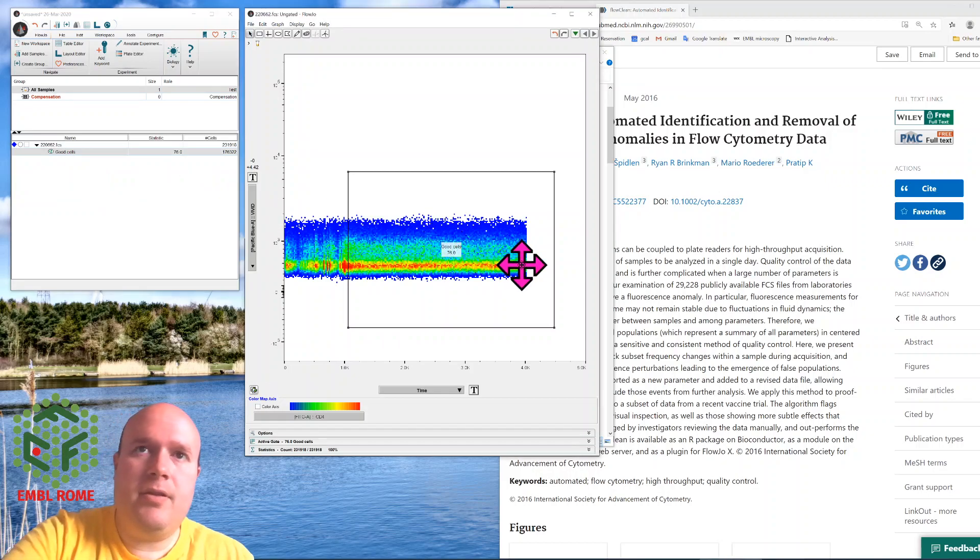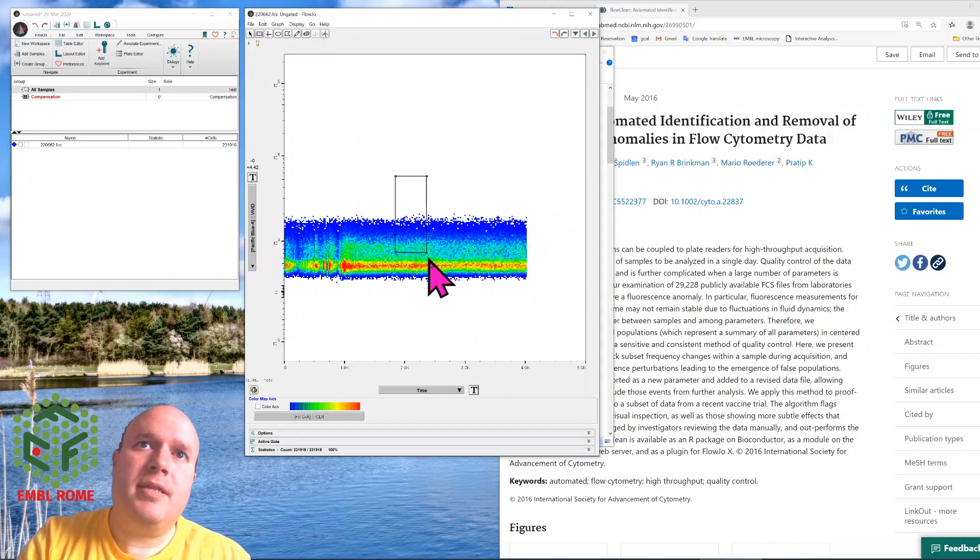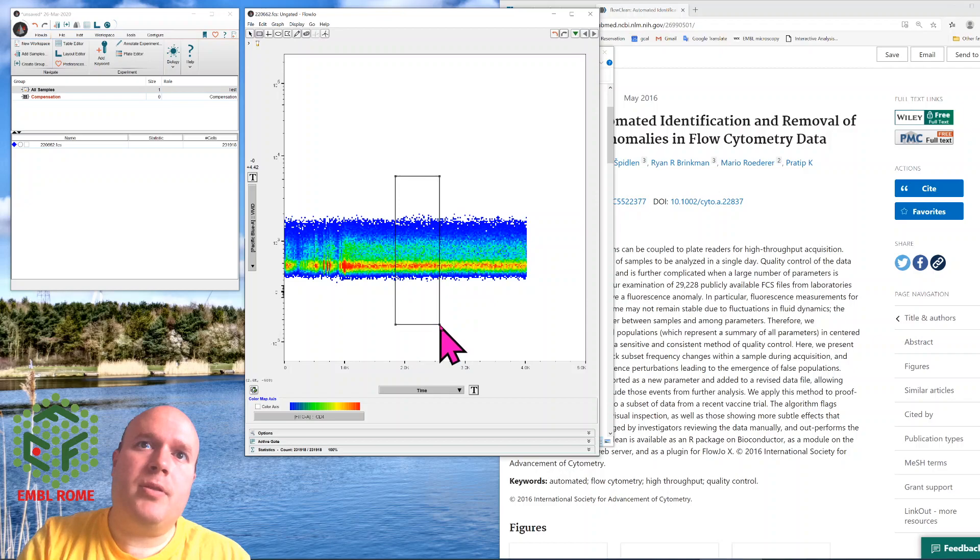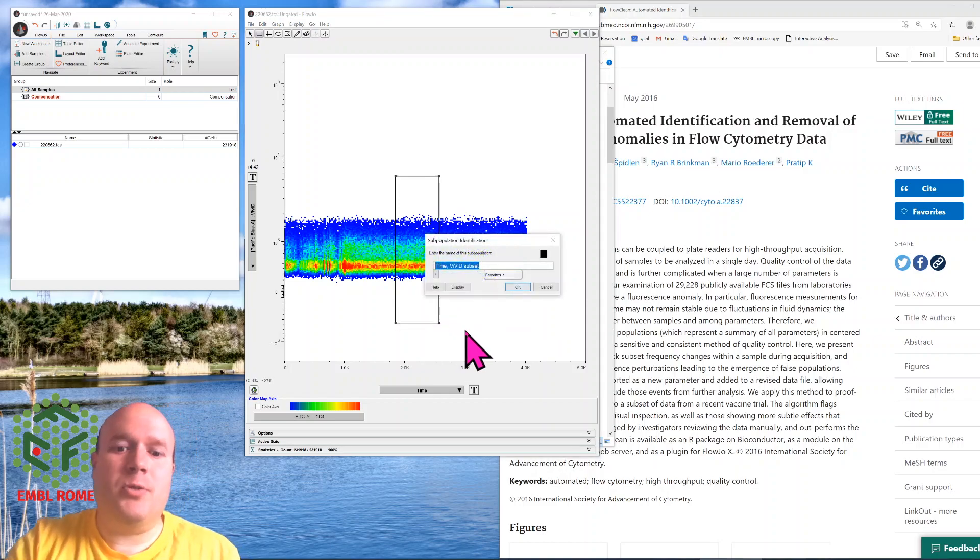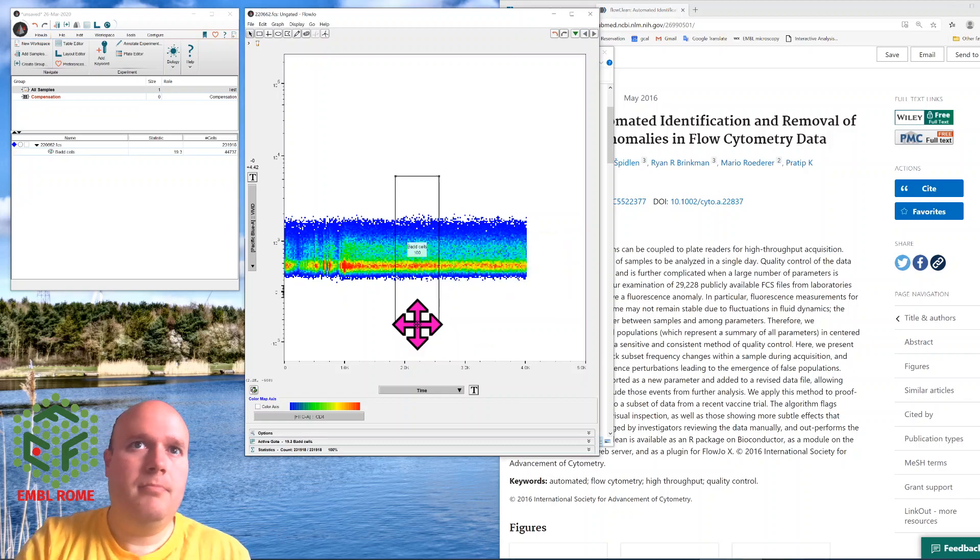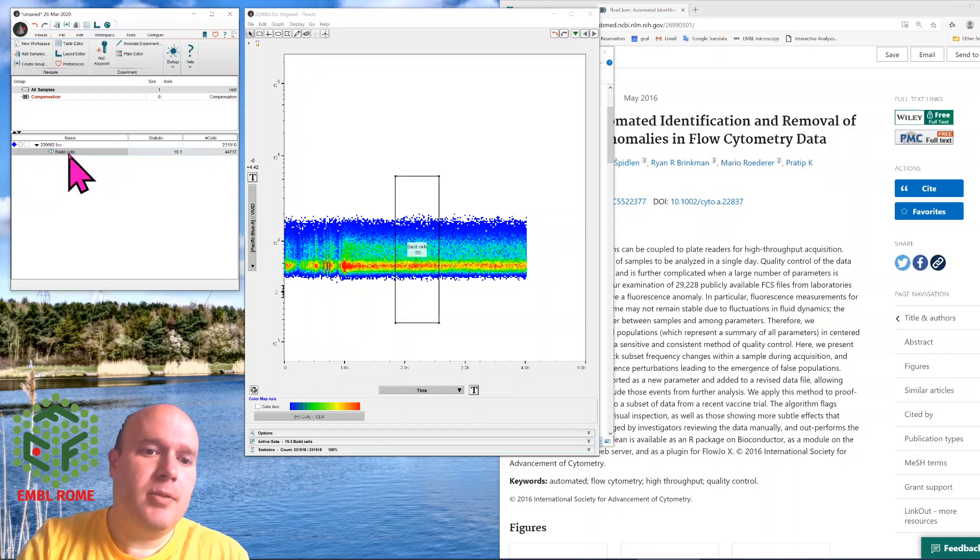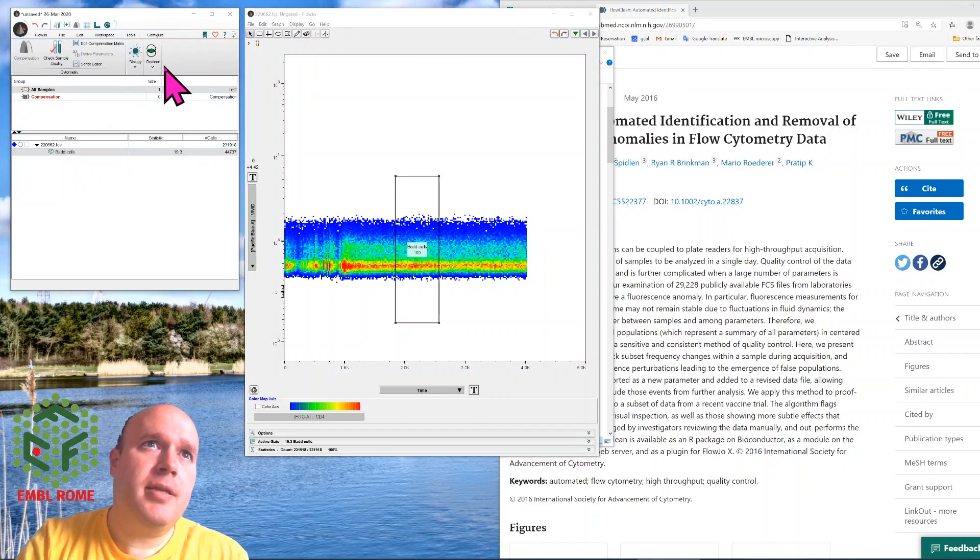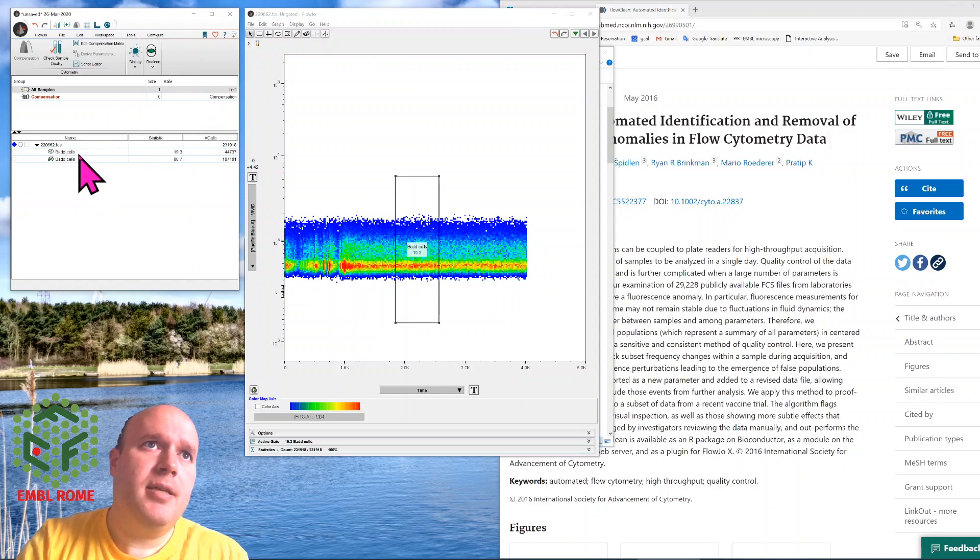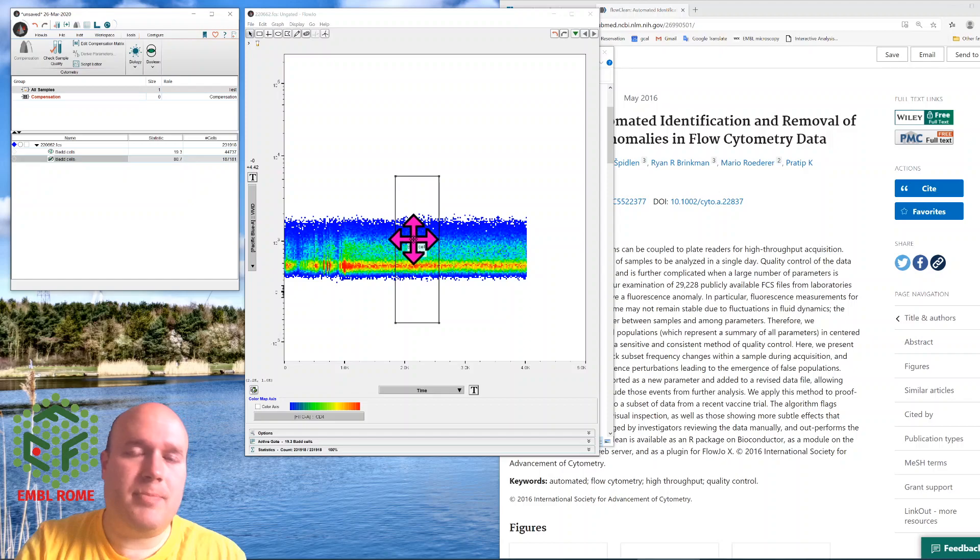If my abnormality was in the middle, say here, I would do the opposite. I would call these bad cells, highlight them over here, click tools, click boolean gating, and choose a not gate. And then I do my analysis on these not bad cells, which is everything that's outside of this box.